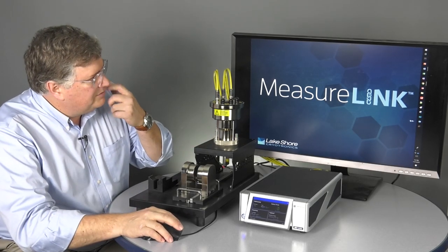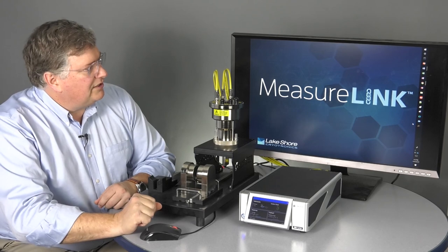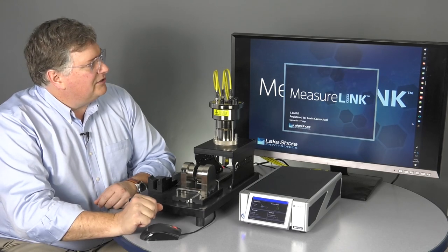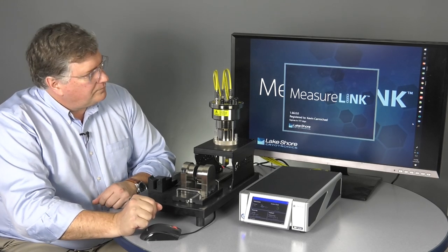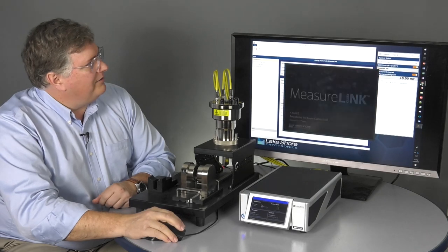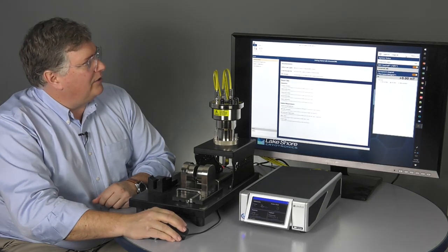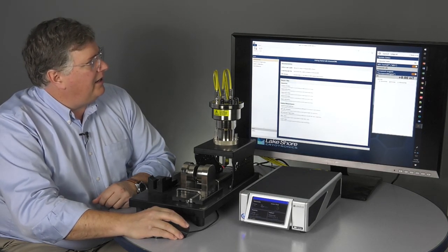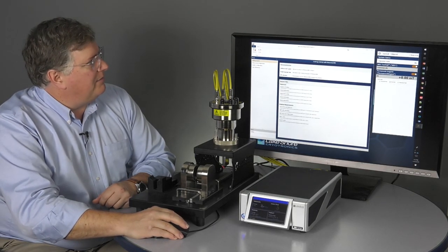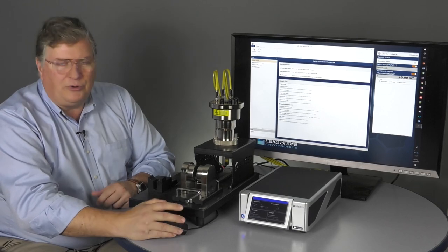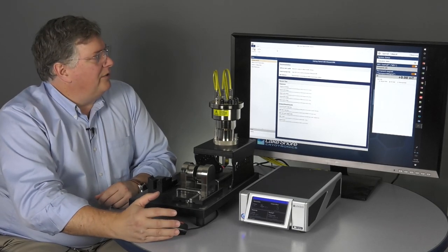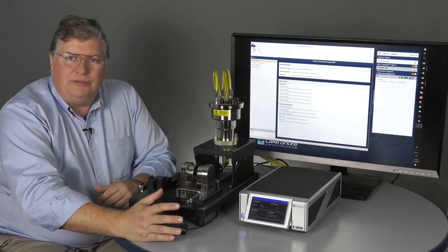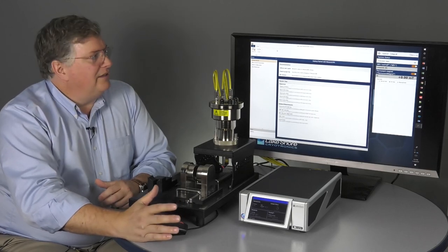In terms of the measurement, we're going to use MeasureLink. So, on the MeasureLink software, let me just start that up. What we have in MeasureLink software, this is the monitor pane, and this is the main window. So, what we have is some pre-written scripts that we can run using MeasureLink with basically a touch of a button.